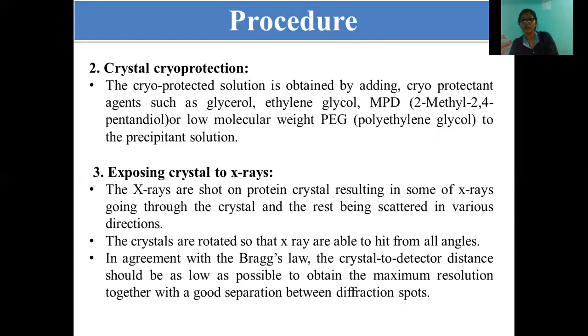Overcooling is also hazardous, and overheating also affects the protein structure present in that crystal. So to avoid overheating and overcooling, we treat that crystal using various cryoprotectant agents like glycerol, ethylene glycol, etc.